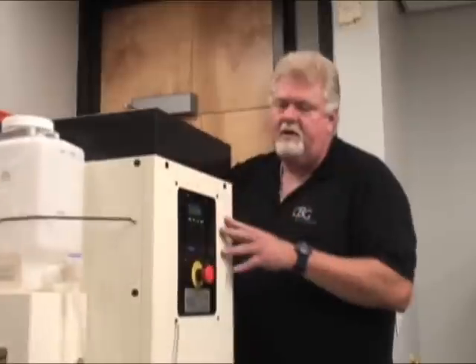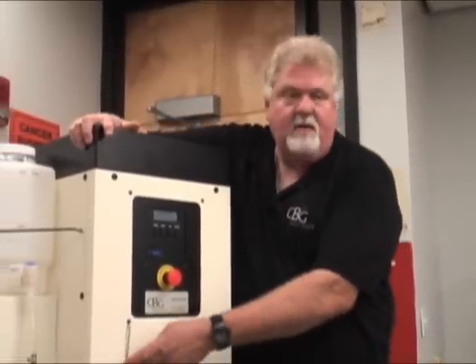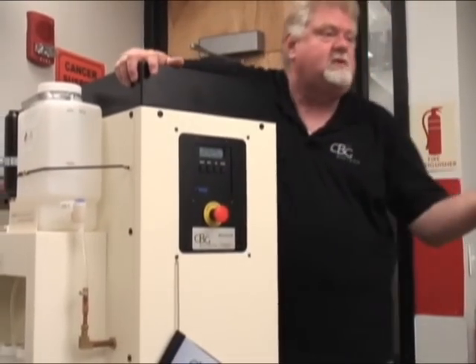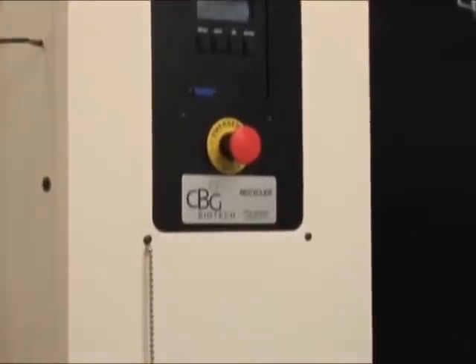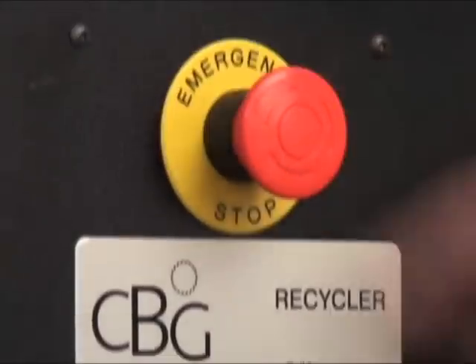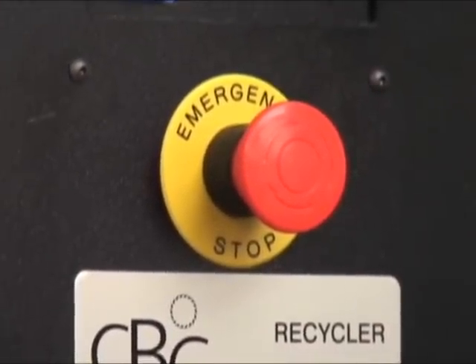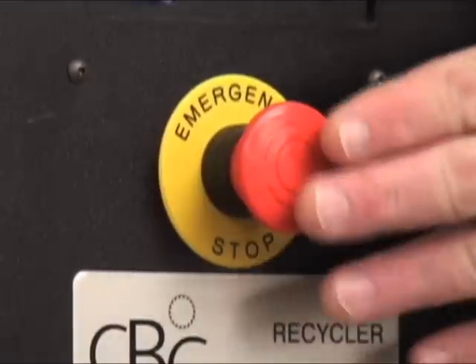Let's go over a little operation — real simple. This is your primary operational point here. A manual attached to the unit will help you with operation. We have an 800 number, 24/7 customer service. We're located in Columbus, Ohio, available from 7:30 in the morning until 6 o'clock at night eastern time. The emergency e-stop is there because it's UL certified — certified to be safe in labs. UL requires that you have the e-stop on the system.